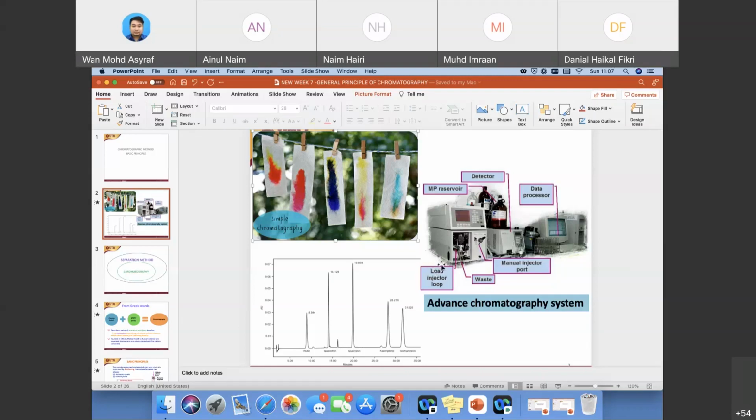So now we know that your pink ink does not have only the pink pigments. It also has yellow pigments as well. Whereas when you look at this one, you have a blue ink initially, but as time progresses, it separates into blue, black, and then there is a yellow pigment as well inside the blue ink. All right.